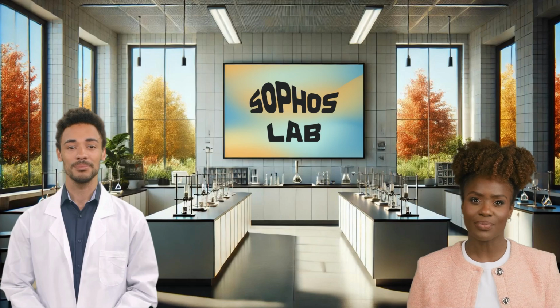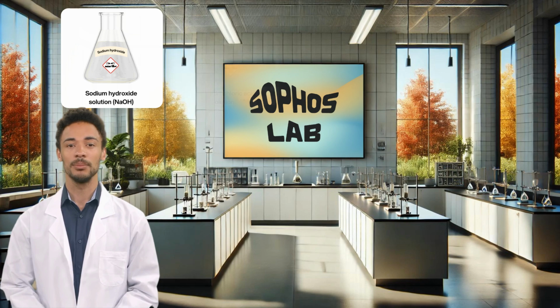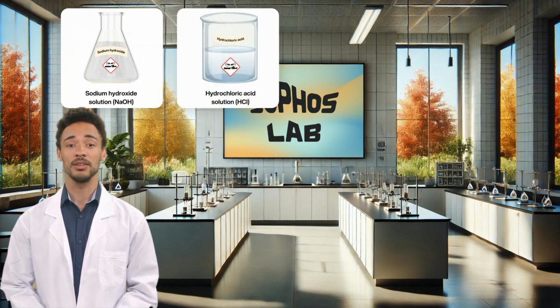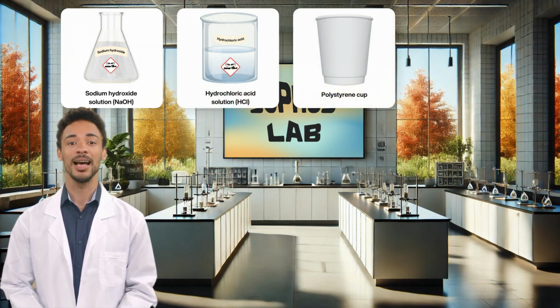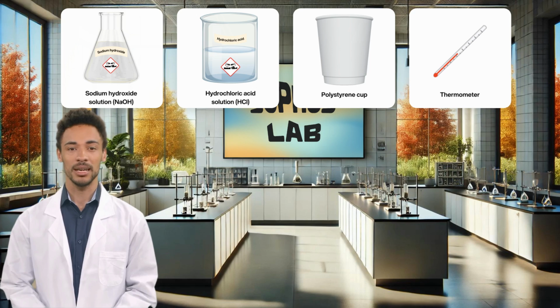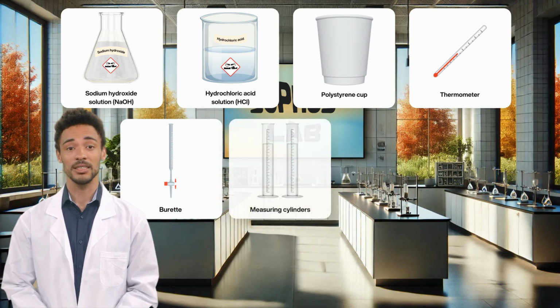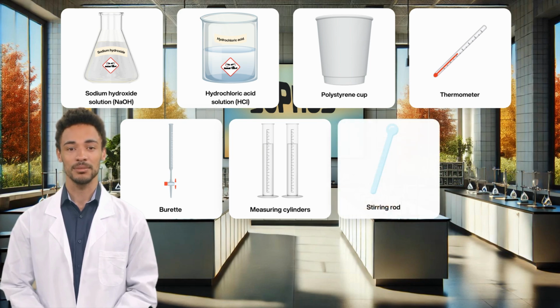On to the practical. Let's start by gathering our materials. Sam, what do we need? So, for this practical, we need sodium hydroxide solution, a beaker of hydrochloric acid solution, a polystyrene cup to act as an insulated reaction container, a thermometer or temperature probe, a burette for accurately measuring and varying the volume of HCl, measuring cylinders for initial measurements, and finally, a stirring rod. Now we can get started.